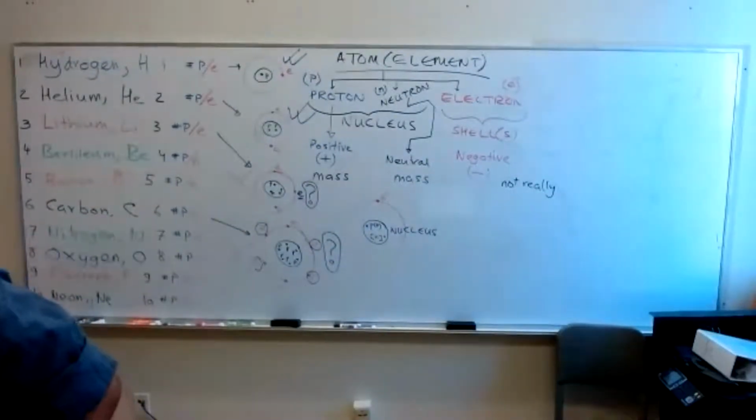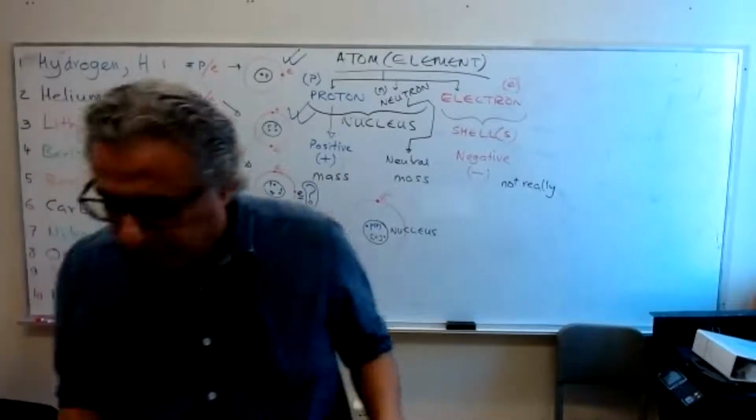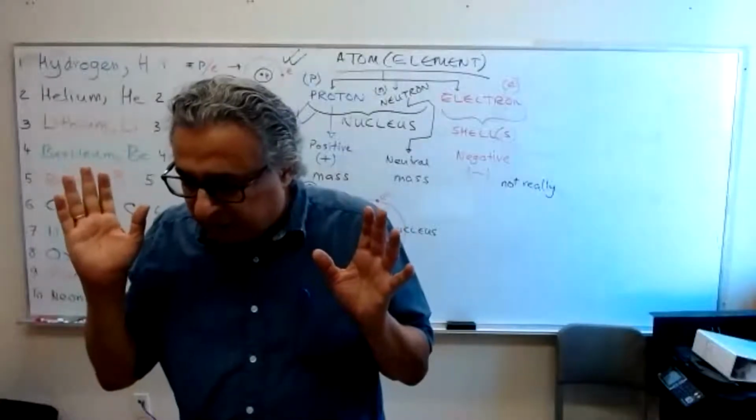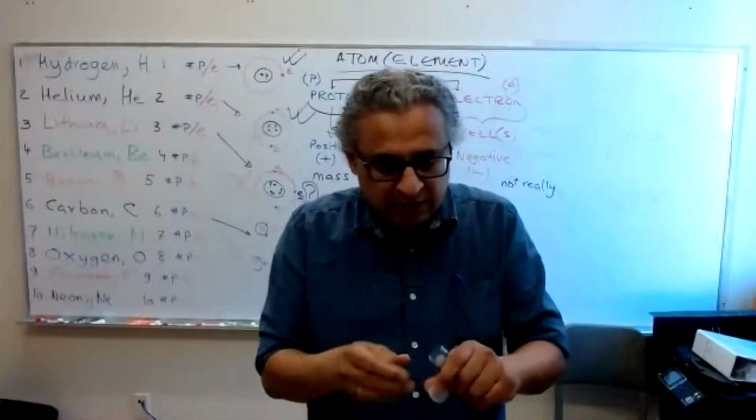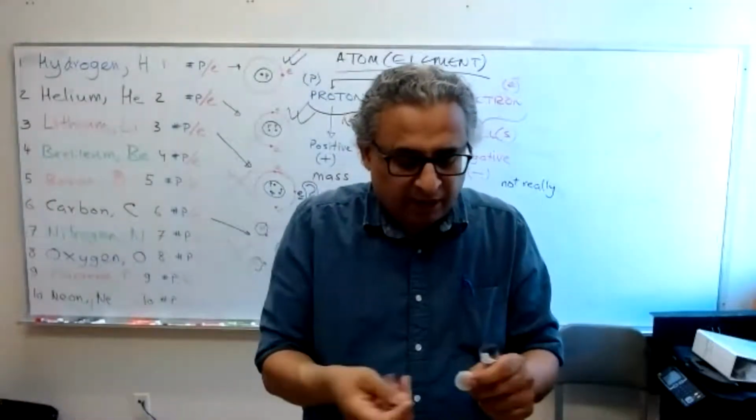I think I don't have anything else to demonstrate. There are some fancy things here to demo, but I don't think I want to do that. This is called a melting point capillary.